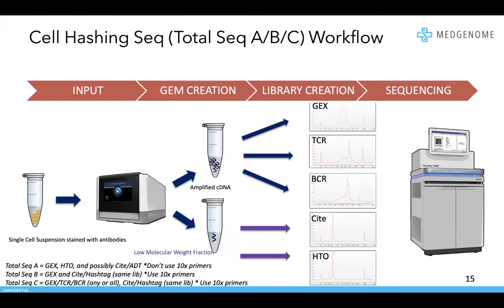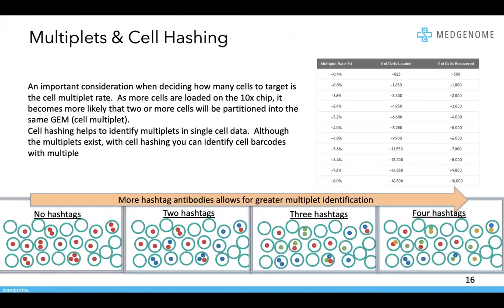So very quickly, I'll go into multiplets and dive deeper into the benefits of cell hashing, and then I'll pass it over to Kushal.